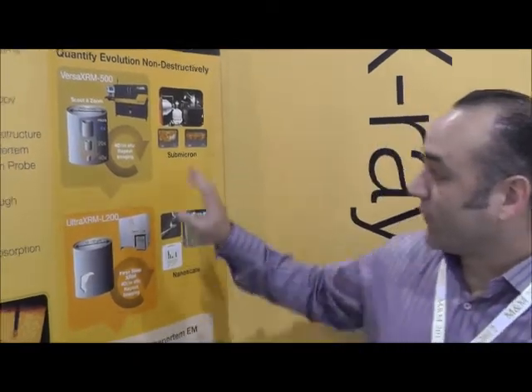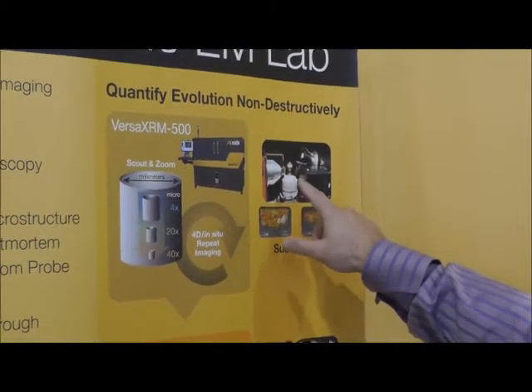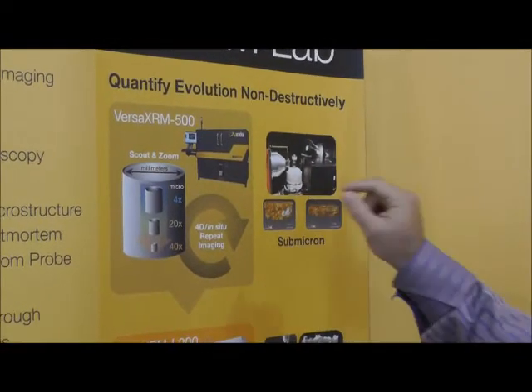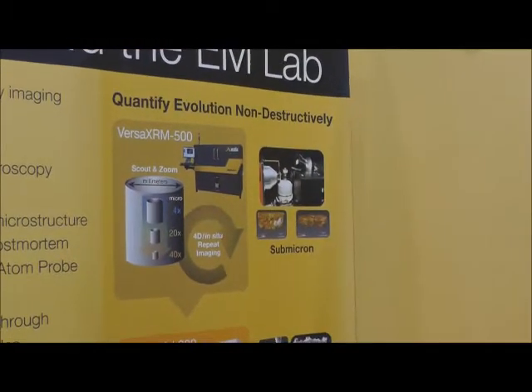So if we look here, for example, these are two of our laboratory system architectures. The Versa architecture, which you see here, is one that we use a great deal for these sorts of in situ experiments. This is actually a rat jaw in a water solution under tension and compression for a cyclic fatigue study. Being able to do these time-based studies and look at how the microstructure evolves ends up being critical, particularly, as I said, before you go into something that's destructive but perhaps can give you a richer quantitative data set, like a FIB-SEM or dual beam.